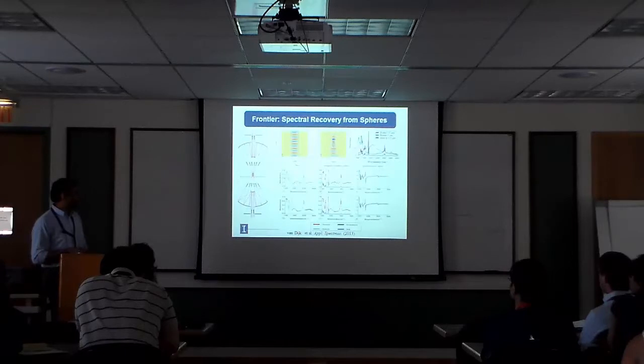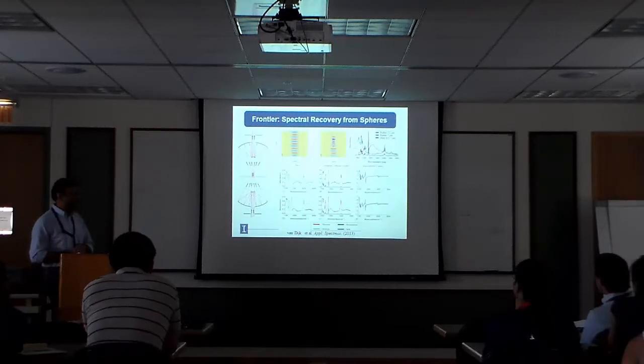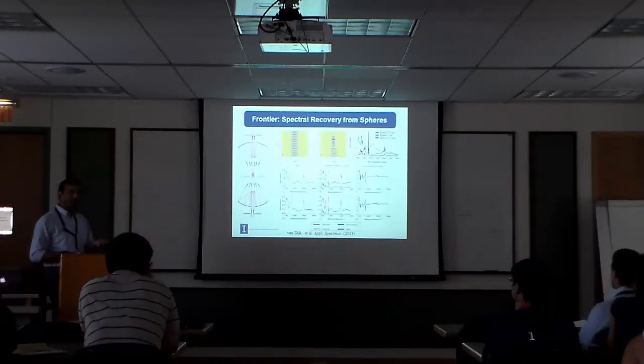But again, long story short, this is PMMA, and if you were to take PMMA spheres of different sizes, you get spectra that look very different. And again, this is valid in infrared or in Raman or whatever technique you want to use. But what we can do now, with the appropriate methods, is recover not only the morphology of the sample, but also the refractive indices at every point. For simple structures, this is possible right now.